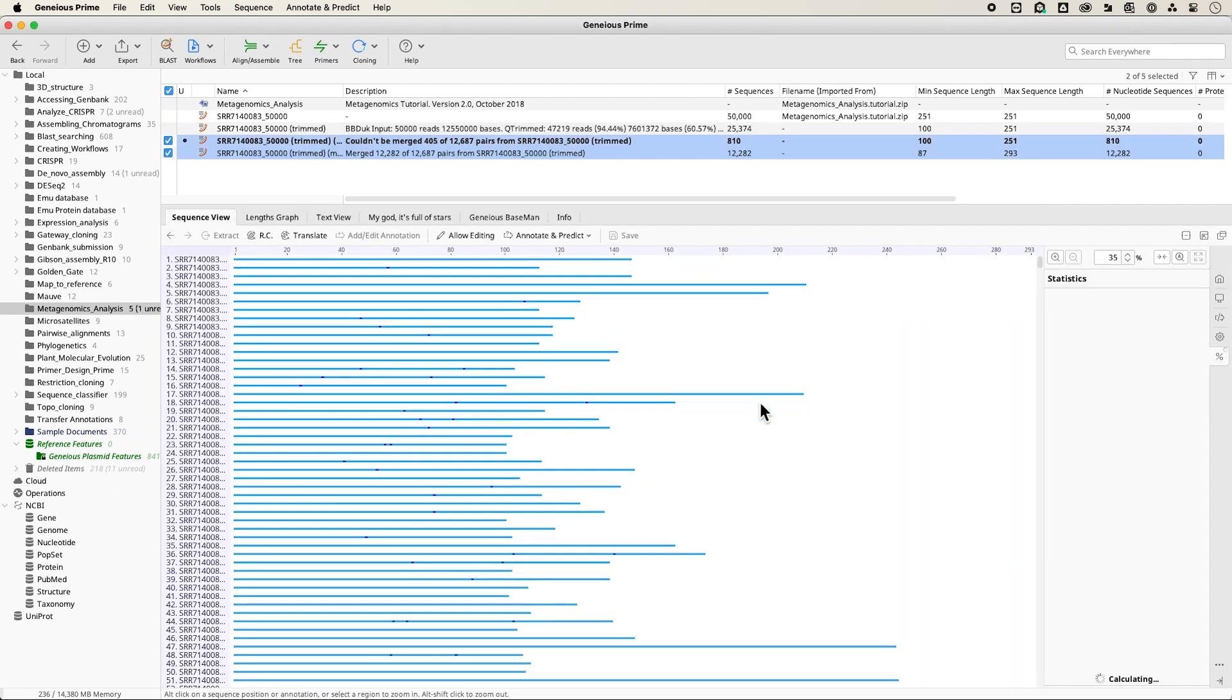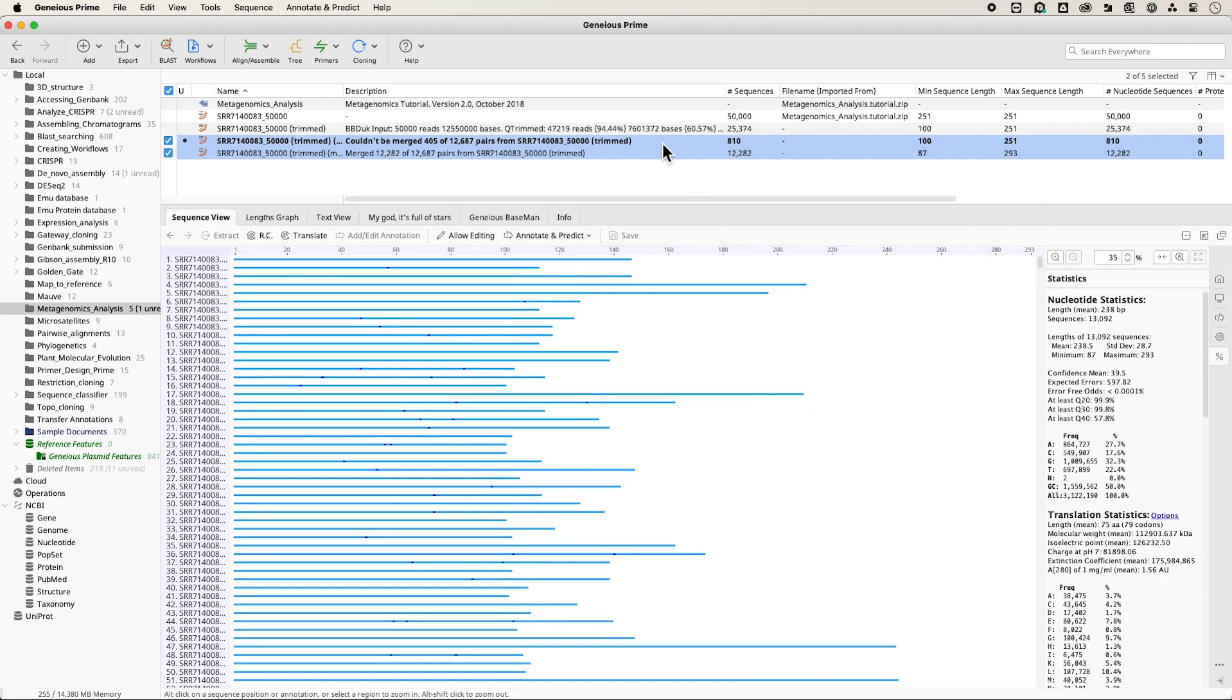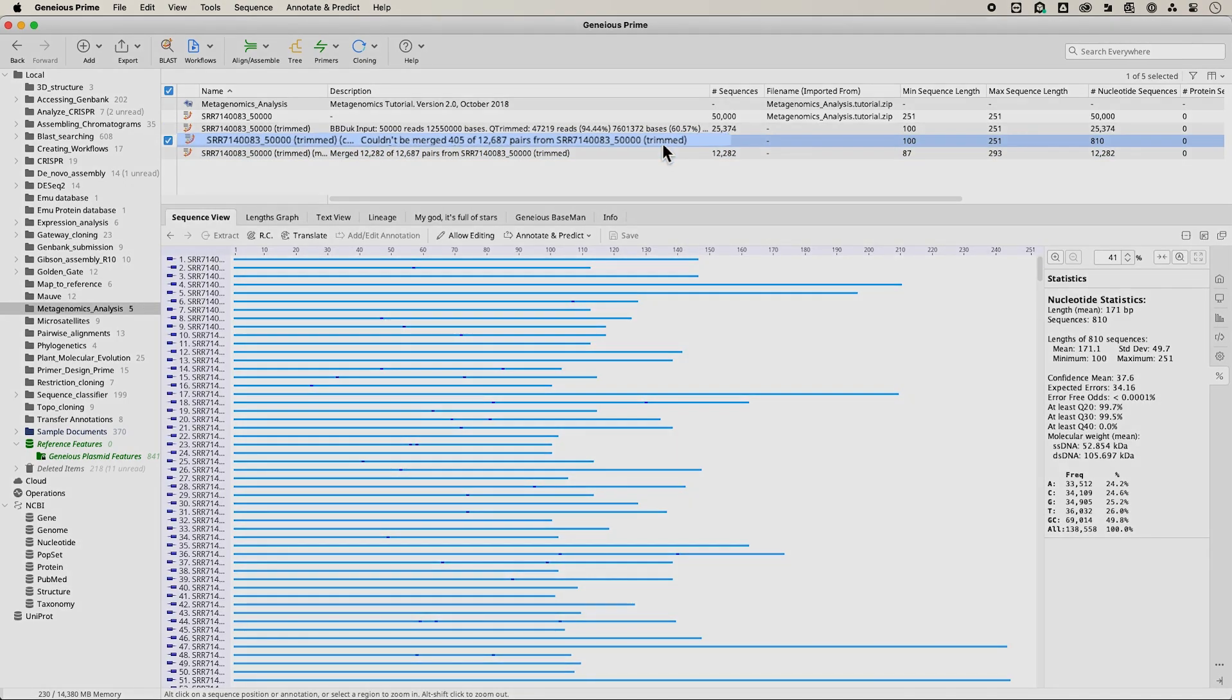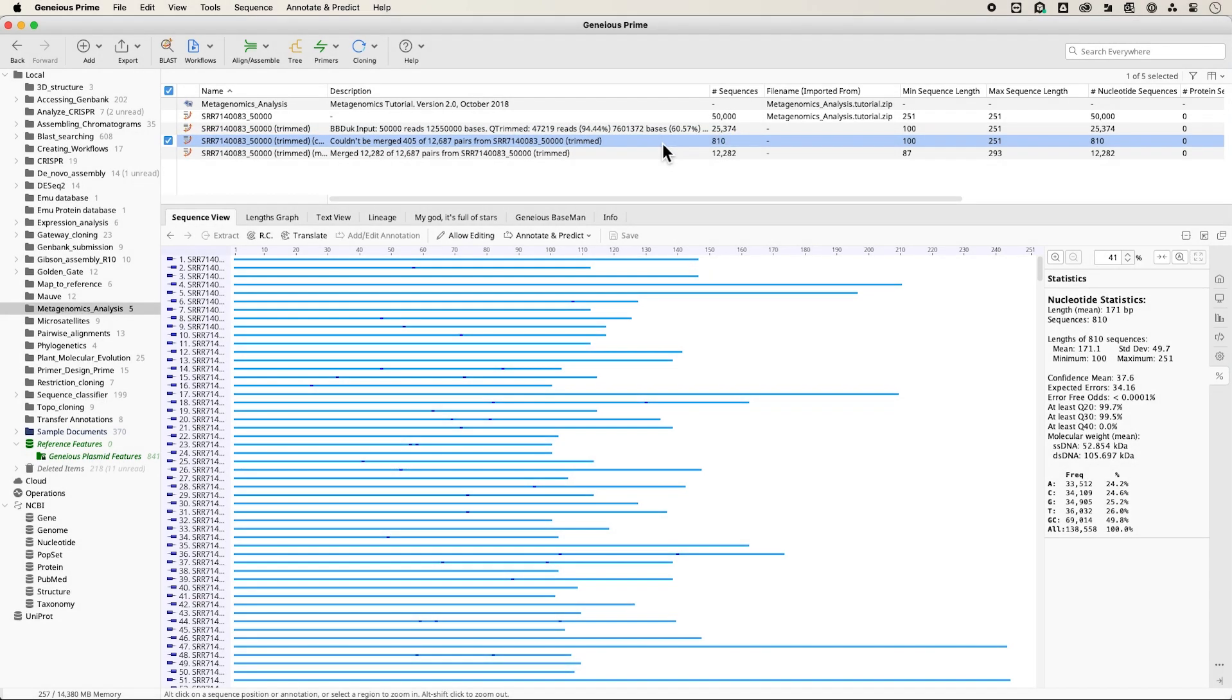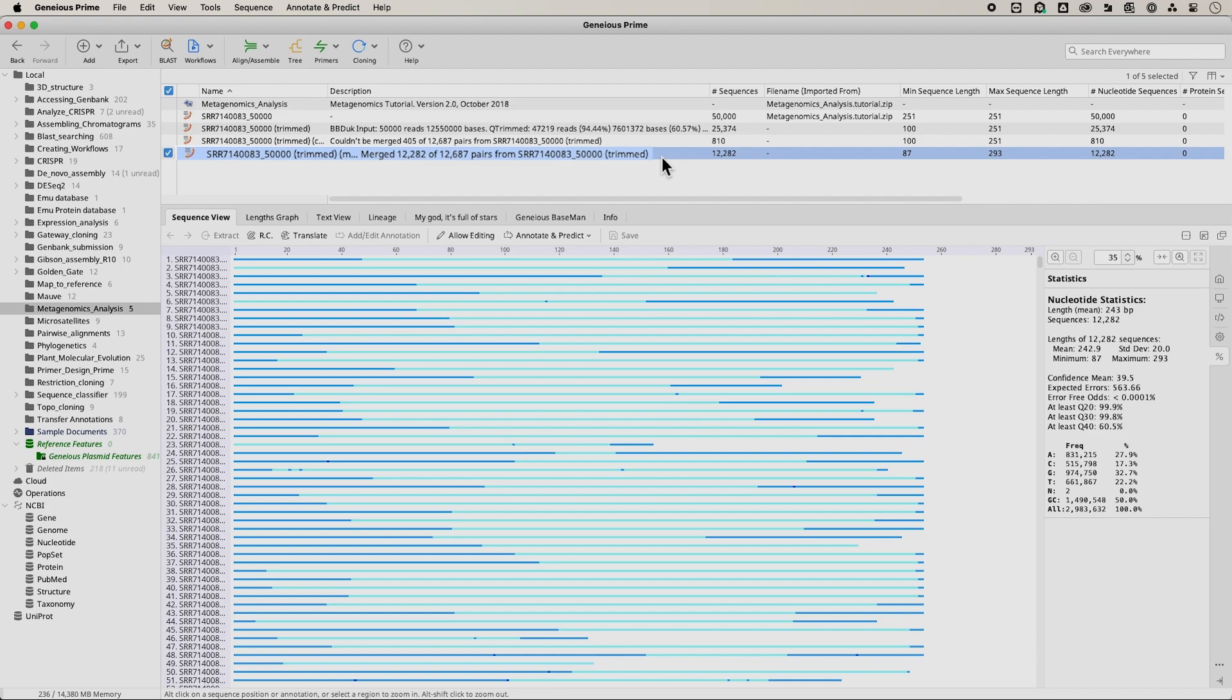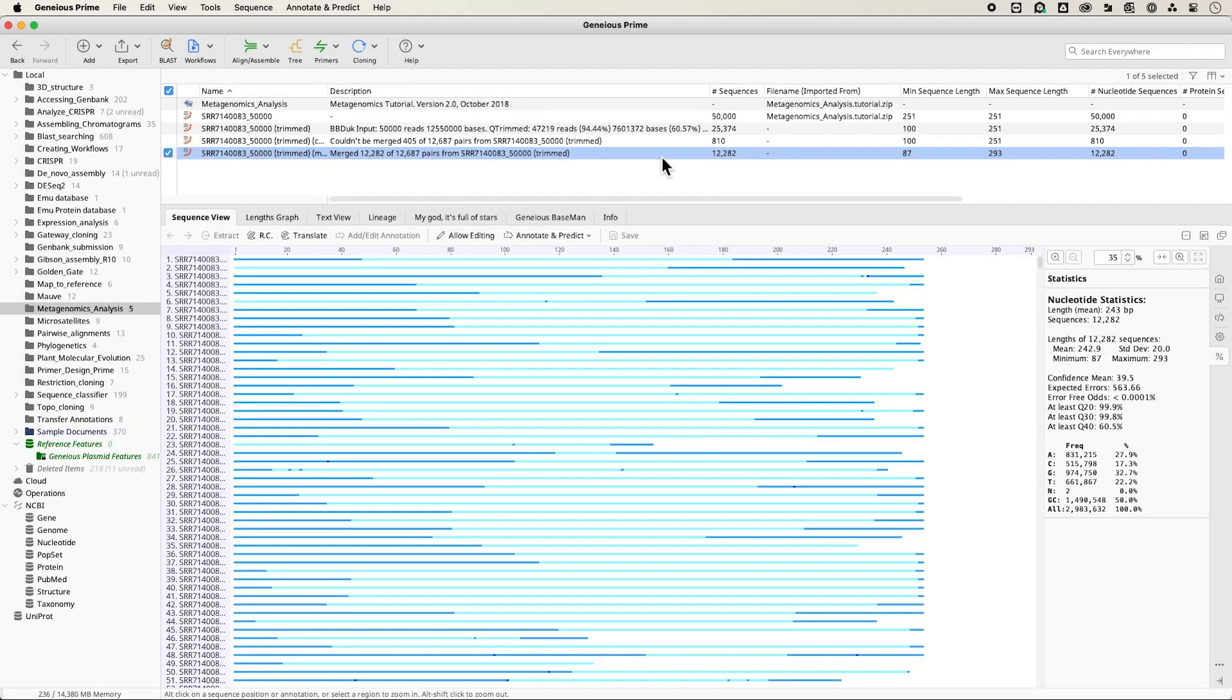Two new files will appear after merging. One file contains unmerged reads, usually because they are too short after quality trimming. This file is labeled 'couldn't be merged'. The other file contains the merged reads.